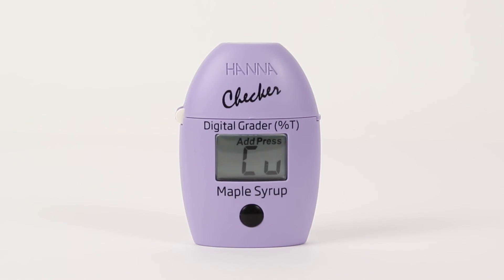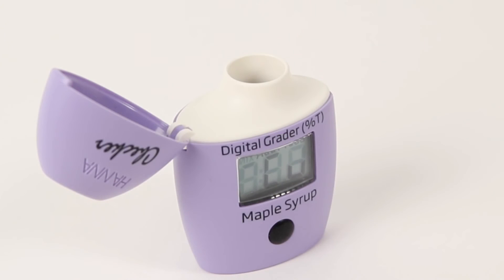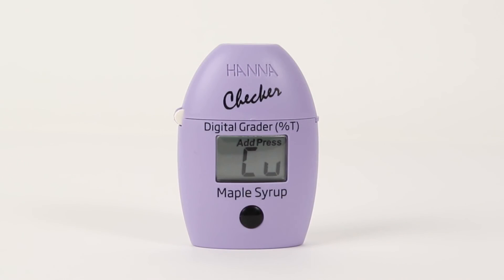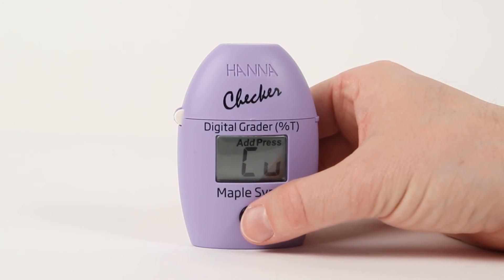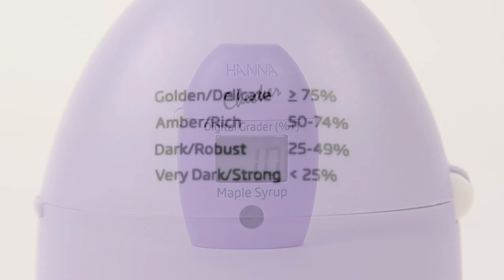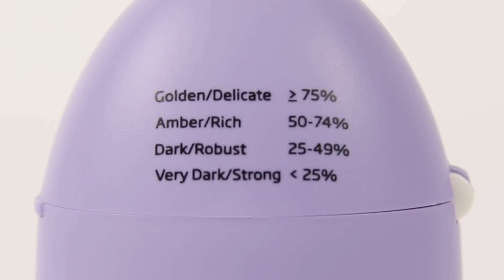When the meter is finished calibrating, you'll be asked to add a cuvette. Remove the reference cuvette and insert your maple syrup sample cuvette. Remember, always use a cuvette — never pour maple syrup directly into the device. Press the button. Three dashes will blink to show the measurement is taking place. When the measurement is finished, the meter will display the percent light transmittance of the maple syrup.